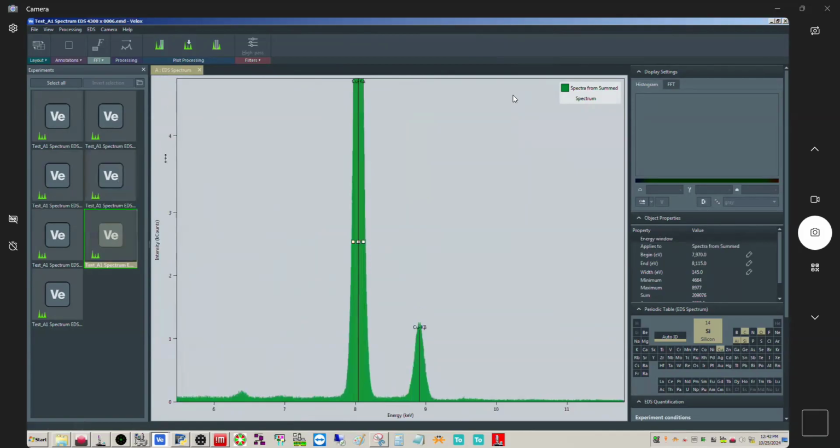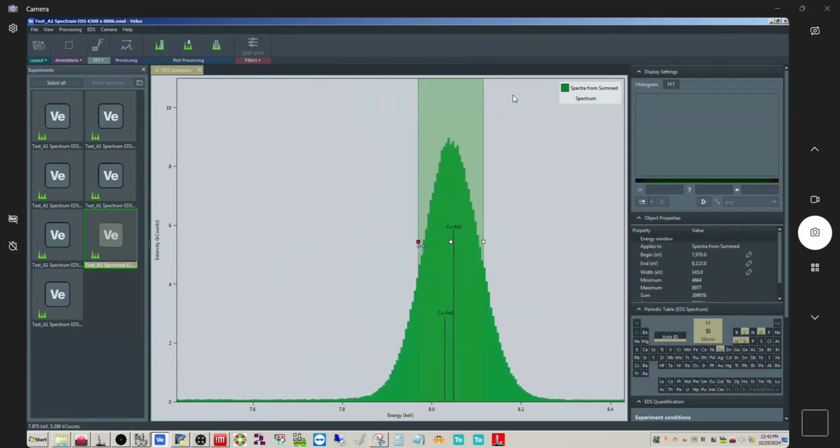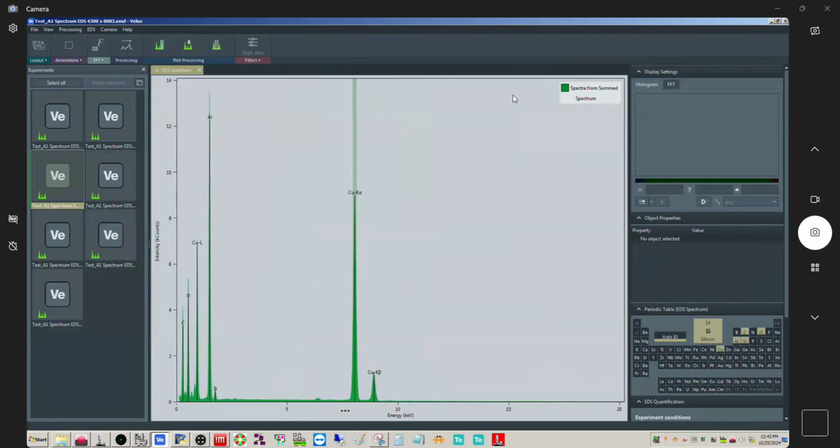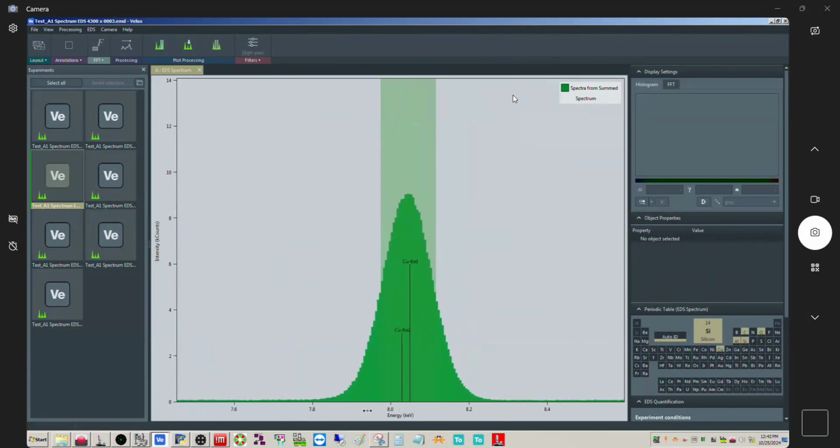Yeah, so this is actually a little bit, and again, this is an unscientific measurement to say the least. This is actually very similar in terms of the full width half max, the optimized versus the high resolution. So that's just another reason why to probably just use optimized here.